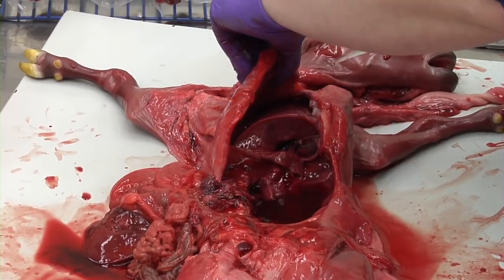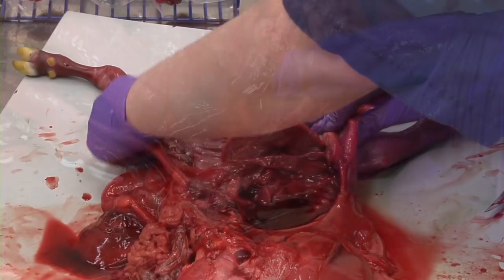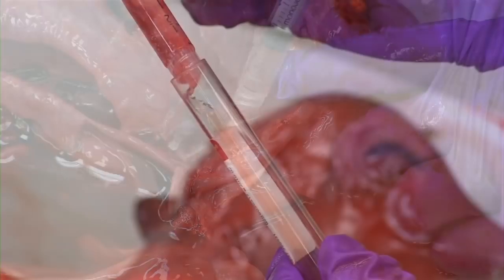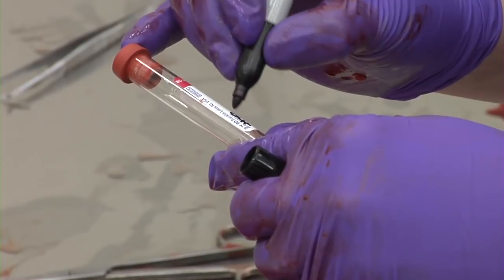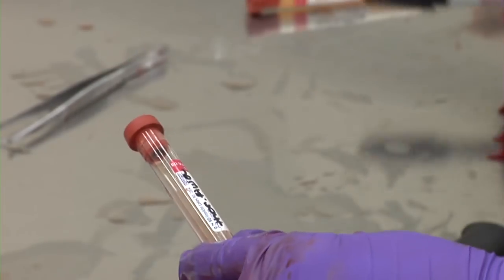Now, open the thorax by transecting the ribs at the costochondral junctions and reflecting the entire rib cage dorsally. If there is any free fluid in the thoracic cavity, use another syringe to collect a sample and place it in a red top tube. Please make sure to label the tube with the origin of the sample. This sample can be used to check for fetal antibodies and place a serum.